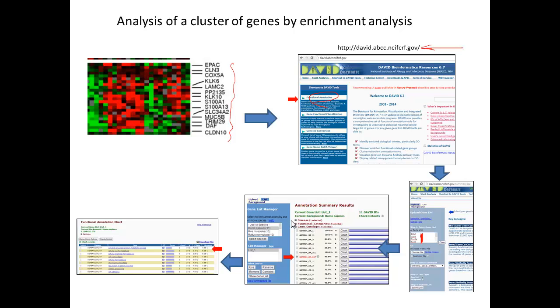They will analyze this along many different considerations, but one that we're interested in is molecular function, which is characterized by the gene ontology. Again, we will deal with that in the lecture on computational biology, and I want to look at the chart that is related to biological process. I want to know what biological processes my list of genes are involved in. So if I click on this link, I will get this output.